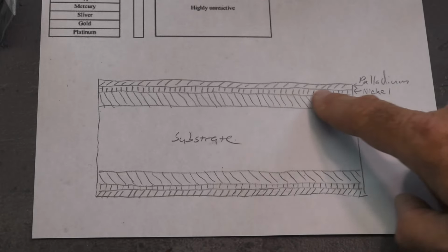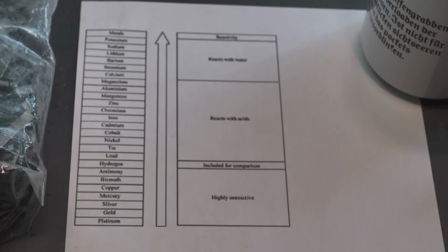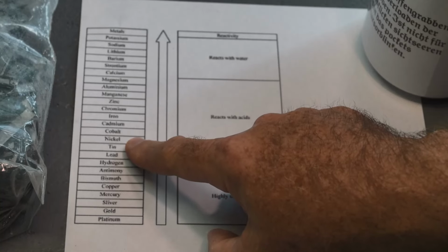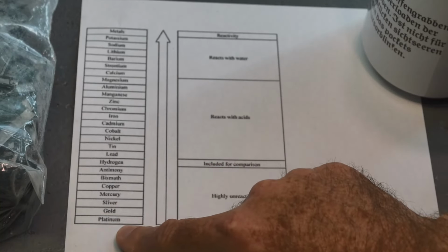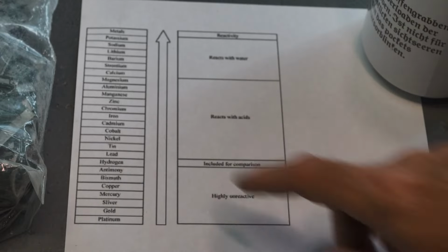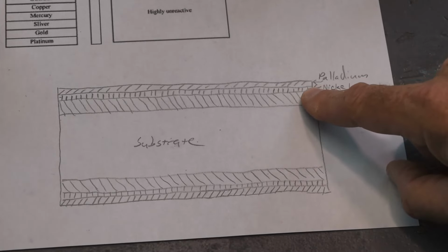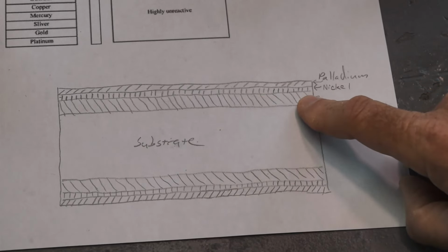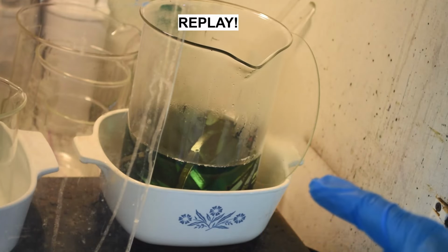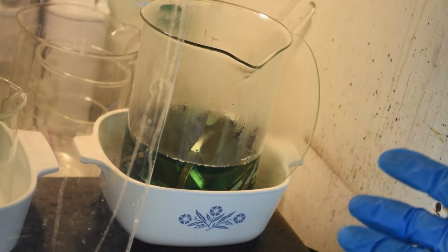And I think that strong reaction was the nitric acid reacting with the nickel layer. Because if we look at our old friend up here, the reactivity series of metals, we can see that nickel up here is much higher on the series than copper or palladium, which is going to be down here somewhere, although it's not explicitly called out on this list. So the nitric acid is going to react with the most reactive metal first, nickel. So I think what it was doing was chewing its way through the nickel underneath the palladium and above the copper. And that was our initial strong reaction. And that's why the liquid turned such bright green. We were making nickel nitrate in there. And I'll tell you what, the liquid has turned a bright green. Okay, bright green. So, what is that? Nickel, maybe?